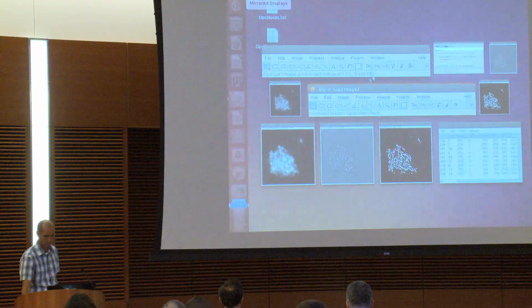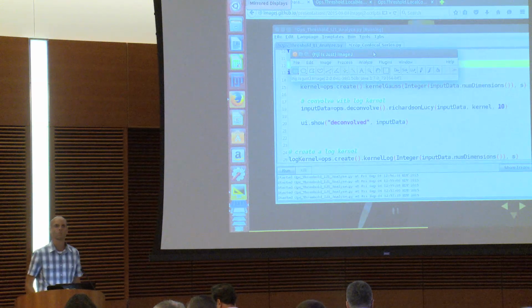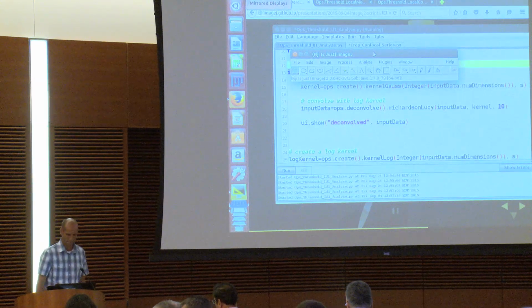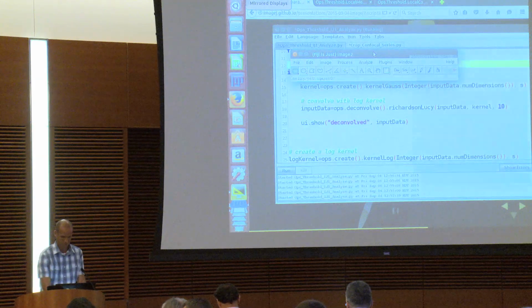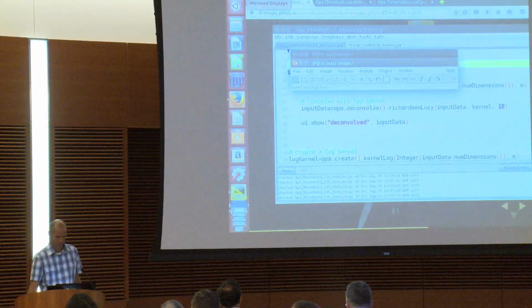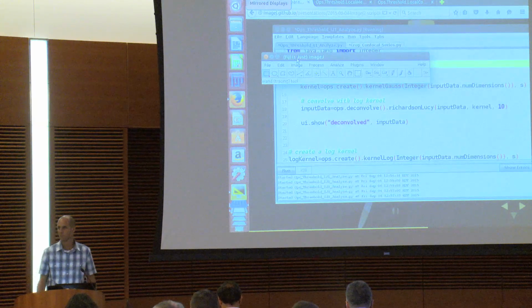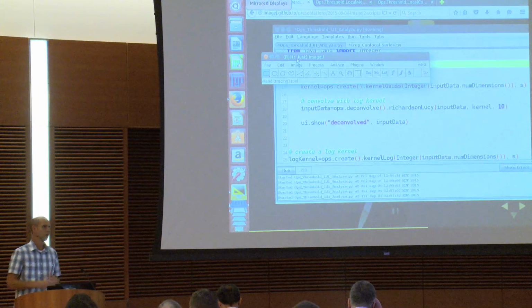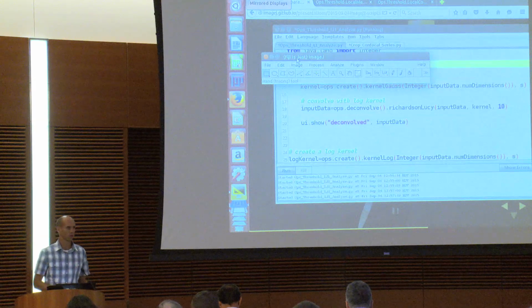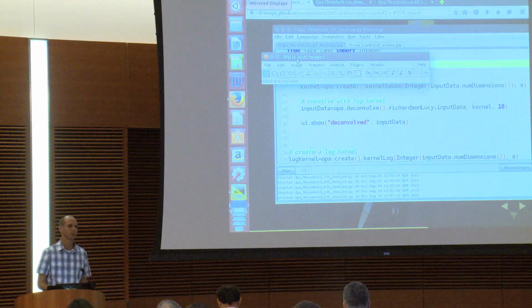So to be clear, by default, ops thresholding works across your entire ND data set. If you have a 4D data set and you say, I want to take an Otsu threshold, it looks at all pixels across all time, all channels, and makes a histogram of that and does it on that. The common case is to threshold each plane, and that's one of the things that this can do. That's a really good point, because ops is powerful, but if you're not careful, it can give you unexpected results like that. It wouldn't really make sense in a lot of cases to calculate a threshold between channels, using the data from both channels.